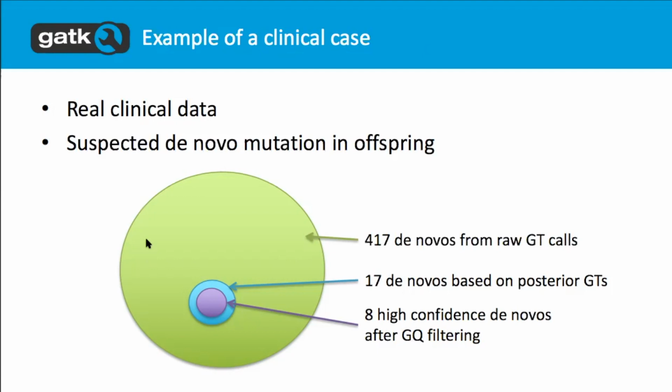They sent those back to the lab, who reanalyzed and did some resequencing on just those sites, which is very cheap at that point. And they ultimately identified correctly the mutation that was causative in that child. So that's helpful, and that's what it's for.